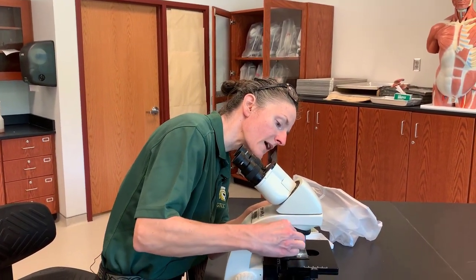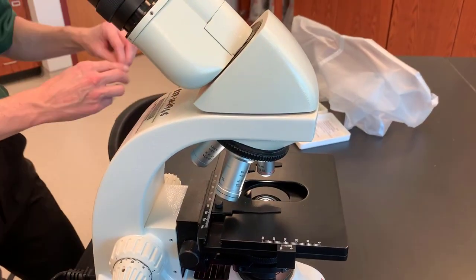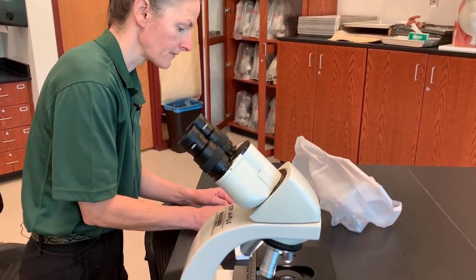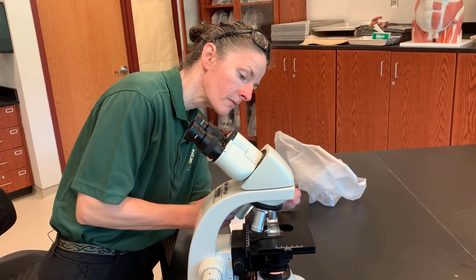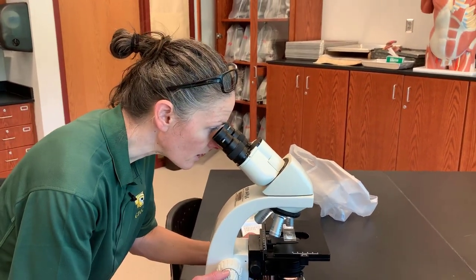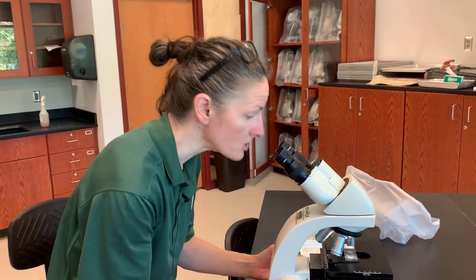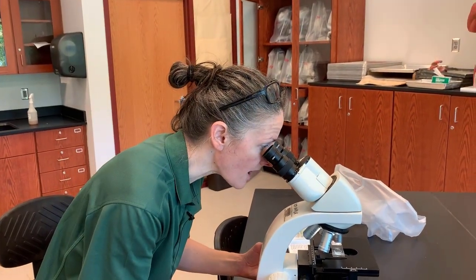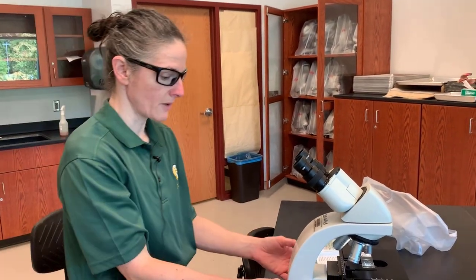Therefore, we always go back to our scanning objective. When we take the slide out and put our next slide in, and center it over our light and look in there, we see that it is already in focus. It requires very, very little adjustment. Once we get our first slide in place, it will require little to no adjustment on the fine focus knobs in order to bring that into focus.